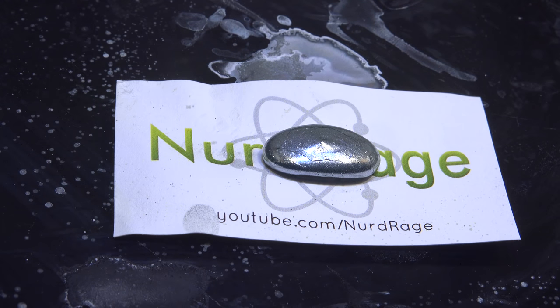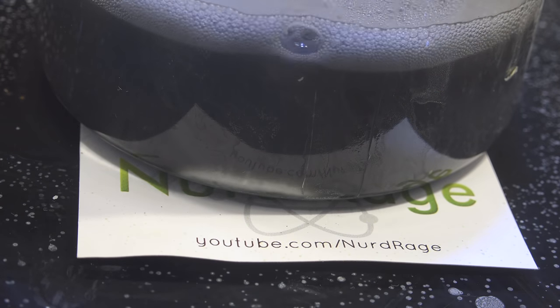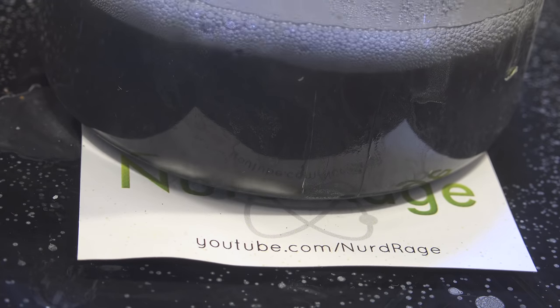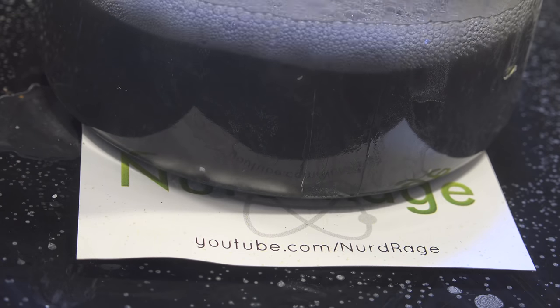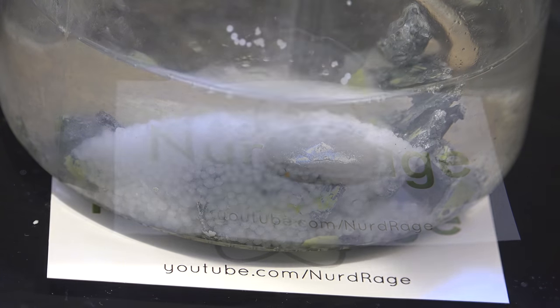Now granted this isn't perfect — a significant quantity of gallium is still in the solution from before and requires advanced solvent separation to recover. In some cases this crude method couldn't retrieve any gallium at all, as the droplets of gallium were too small. But this method is simple to perform for the amateur and just requires some sodium hydroxide and water.